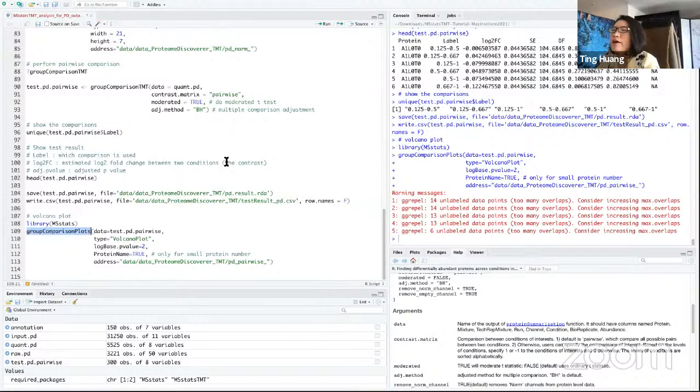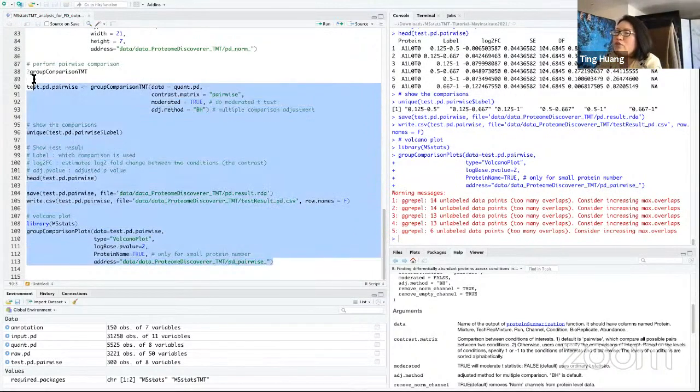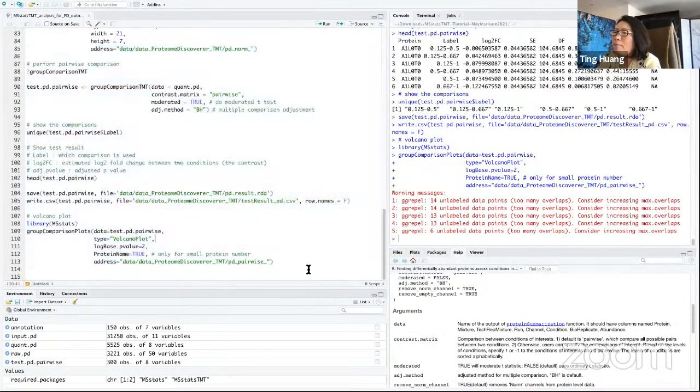Again, for the moderation, we think that if you have more than 5 samples, or 10 samples per condition, then from our simulation results, analysis with or without this moderation will give you very similar results. Okay, given the time limit for the hands-on tutorial, we will just end here.